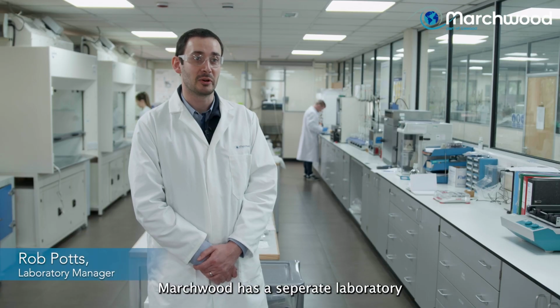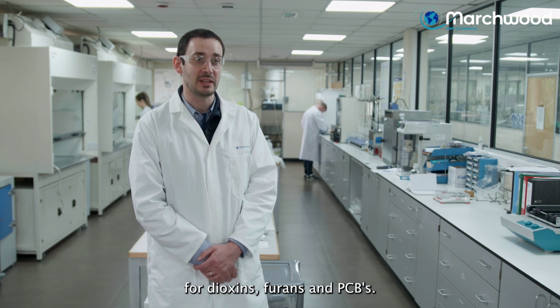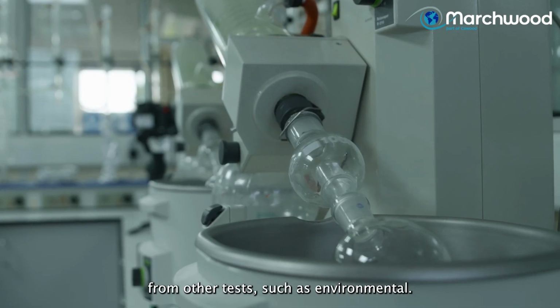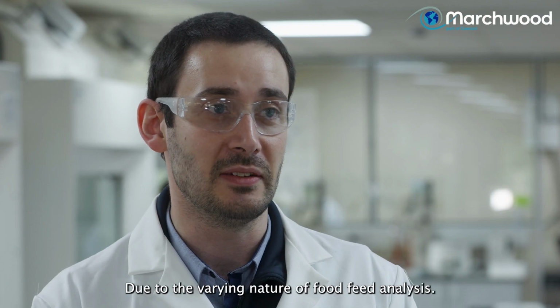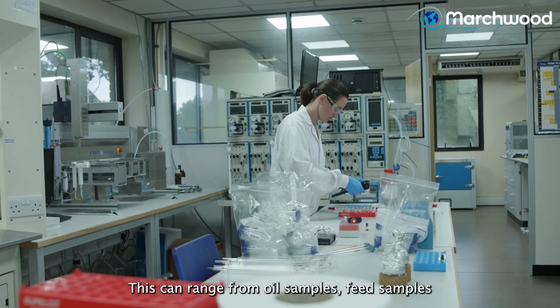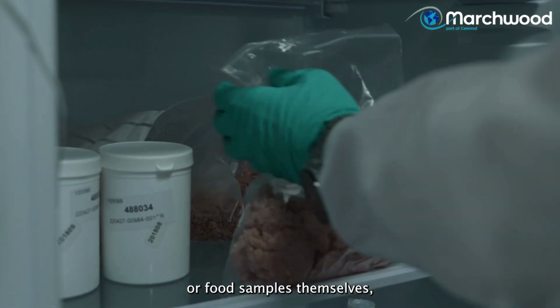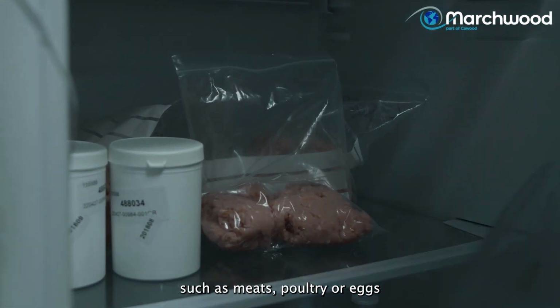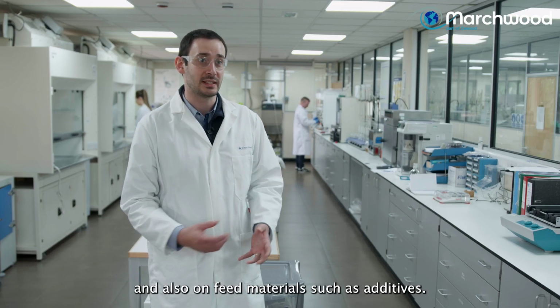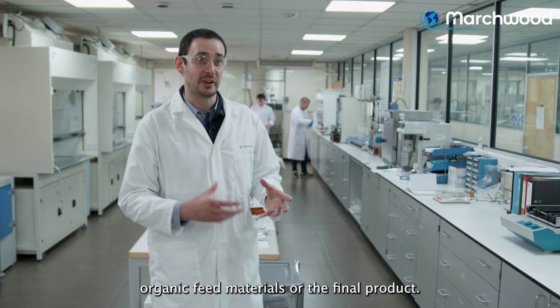Marchwood has a separate laboratory for performing analysis of food feed for dioxins, furans and PCBs. These present separate requirements from other tests, such as environmental, due to the varied nature of food feed analysis. This can range anywhere from oil samples, feed samples, or food samples themselves, such as meat, poultry or eggs, and also on feed materials such as additives, so inorganic feed materials, organic feed materials, or the final product.